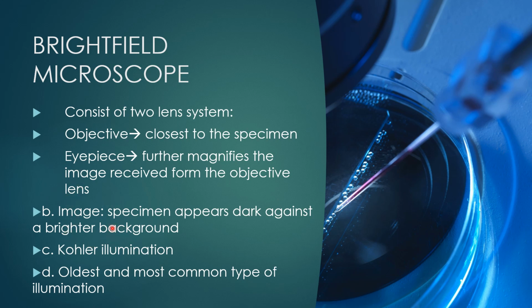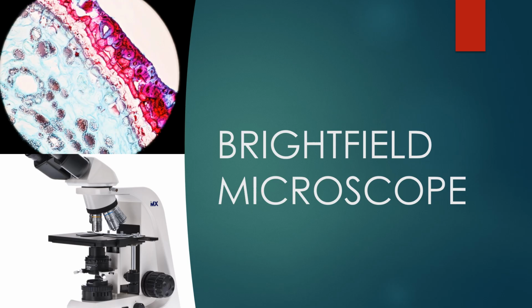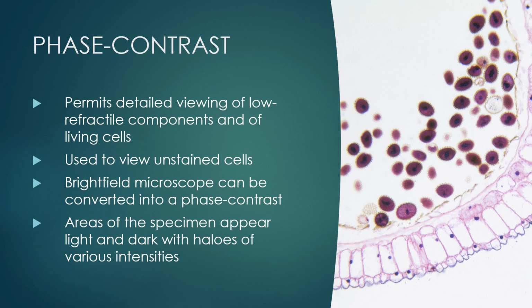In your bright field microscope, the sample appears dark against a bright background. Okay, so you have a bright field for this one. That is the image presented.